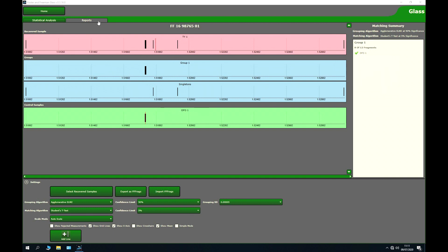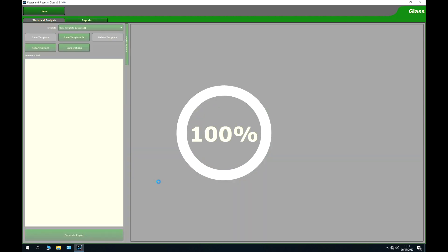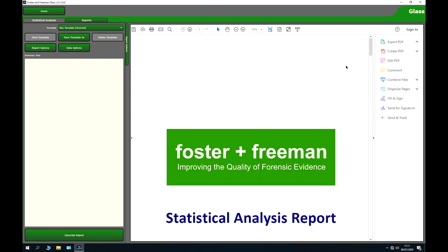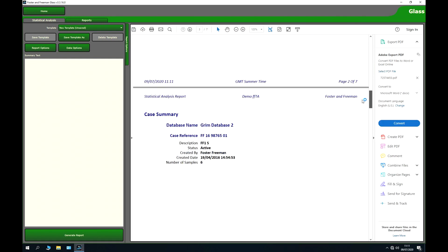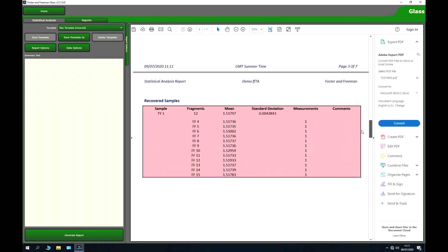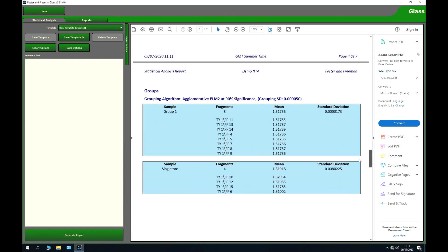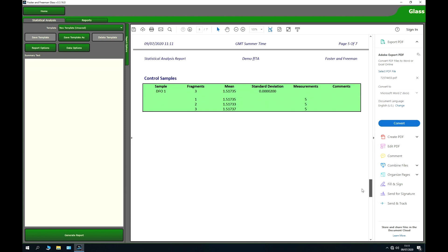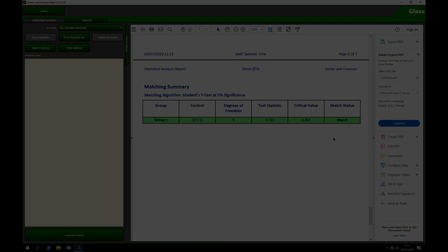We can also generate a report, which will summarise and give the results for all individual glass fragments, with a summary at the end indicating that this is a match.